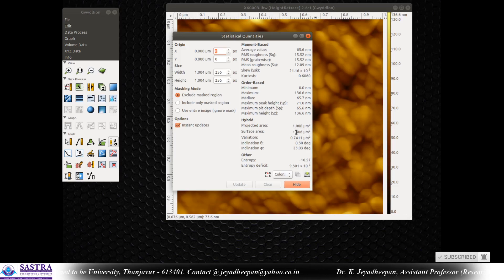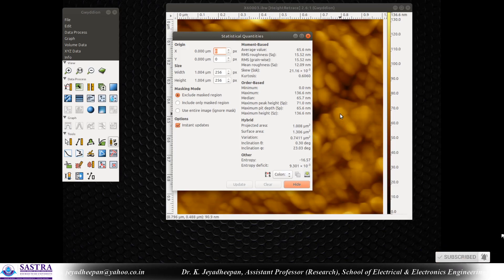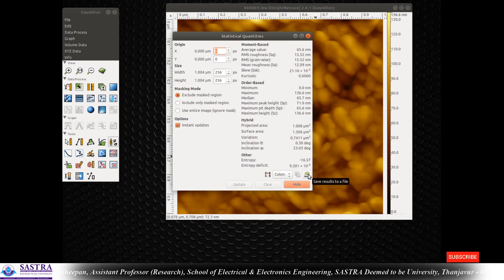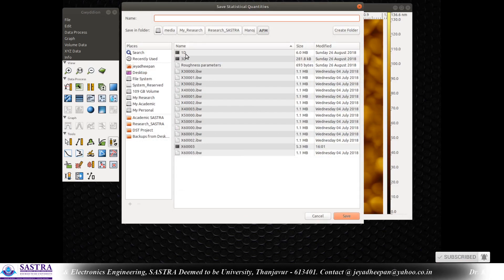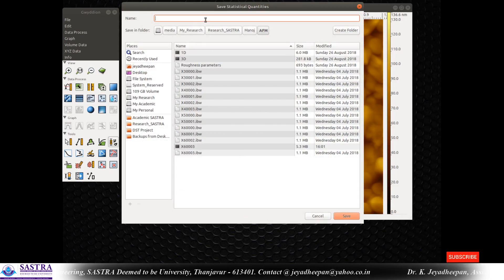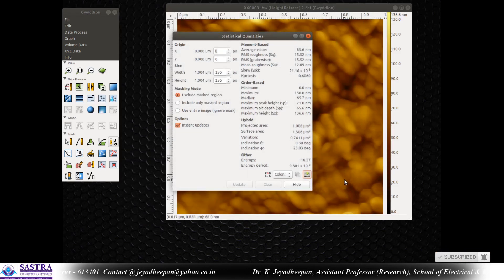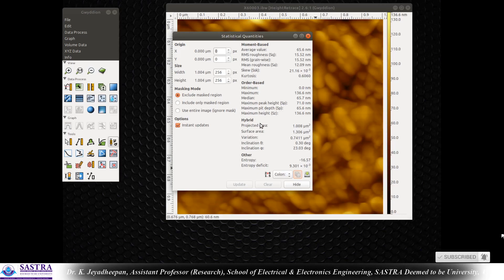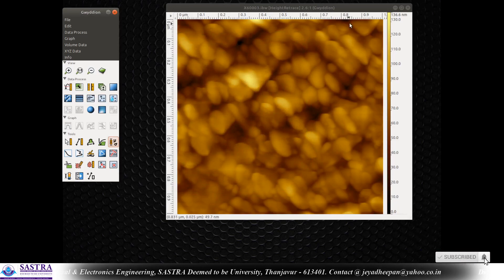The surface area is increased due to the nanostructures present in the topography. If you want to save this statistical data to a text file, you can do so. You can see 1D data, 3D data — all the data are available. You can save the statistical data or copy and paste it anywhere else. I hope this video will be helpful to all of you. Thank you.